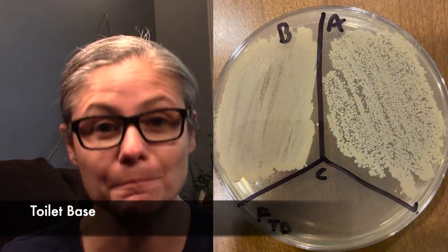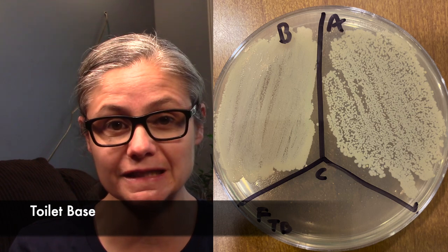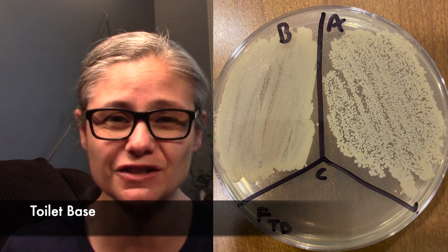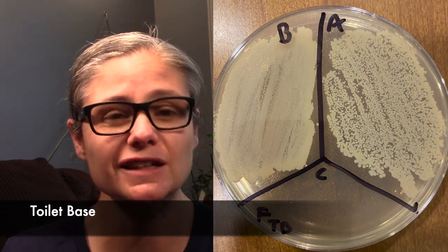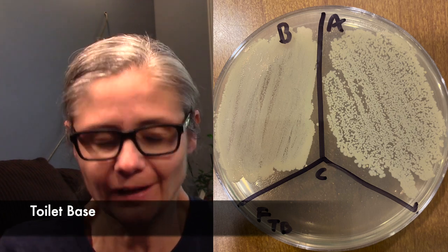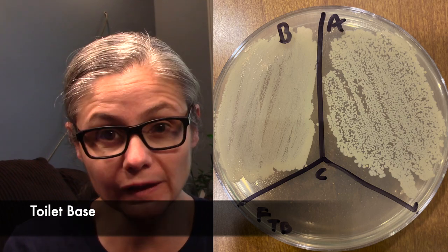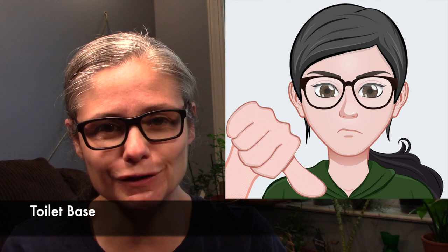The toilet base. Again, in the before section, we can definitely see large smearings of bacteria. You can't even distinguish individual colonies. There's so much bacteria there. In the after section, again, we see a slight decrease. Not much at all. Not impressed with its disinfecting power on my toilet base. I'd say it does not so good for my toilet base. And it most certainly does not remove 99.9% of bacteria.